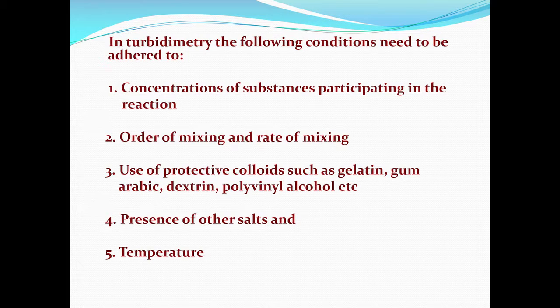The standards must be prepared scrupulously, and the other reagents also must be prepared very accurately. There is no need to overemphasize that all the standards and reagents must be particle free. They should be of very high clarity. There should not be any suspended particles, undissolved substances, etc., in the reagents. That is number 1. Number 2 is order of mixing and the rate of mixing.